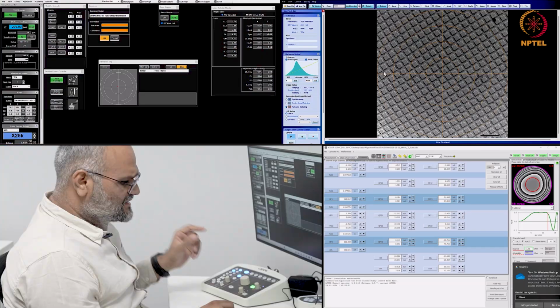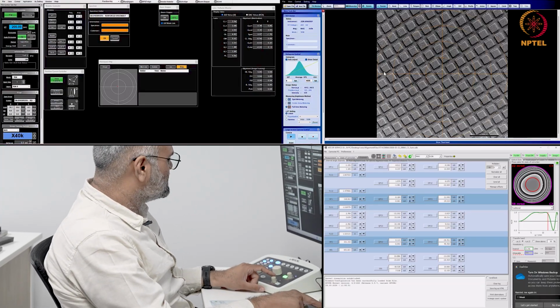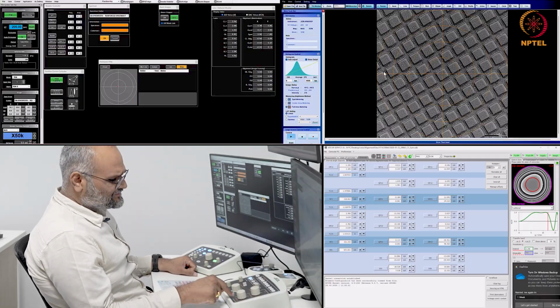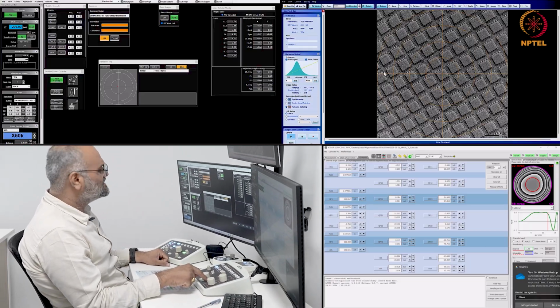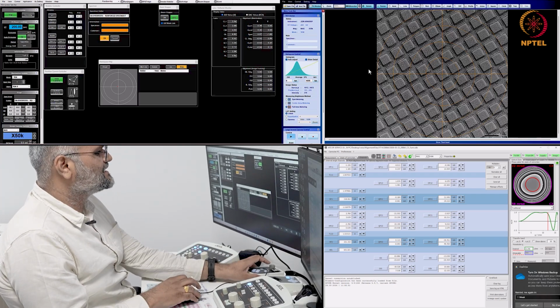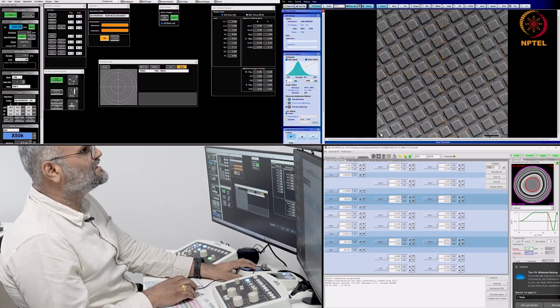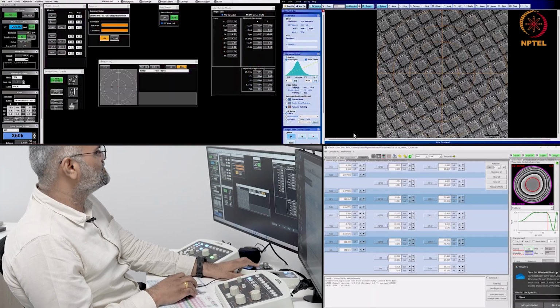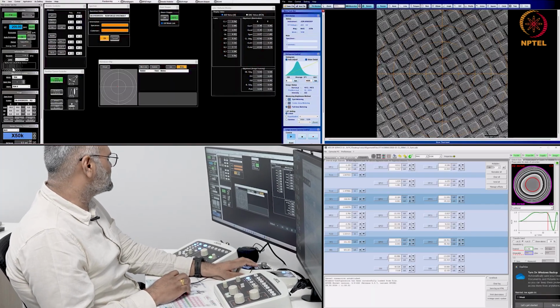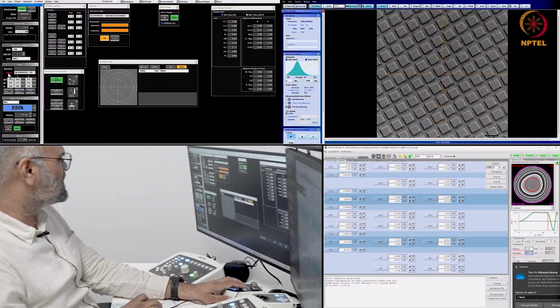Like in any standard microscope operation, once I load into the TEM, the first step is bringing the specimen to the right height. To do this, I have to go to a magnification of around 50,000x, and I press the standard focus a couple of times, and I can start changing the height either by pressing the Z plus or the Z minus, or I can simply go to this holder on this column here.